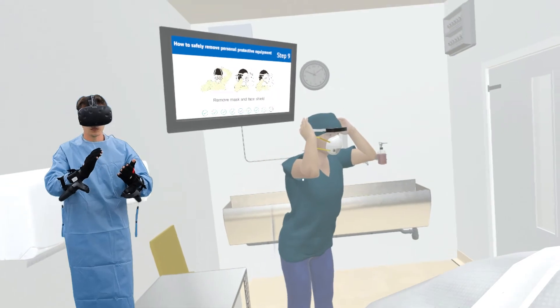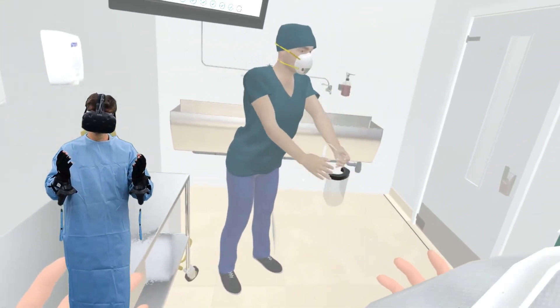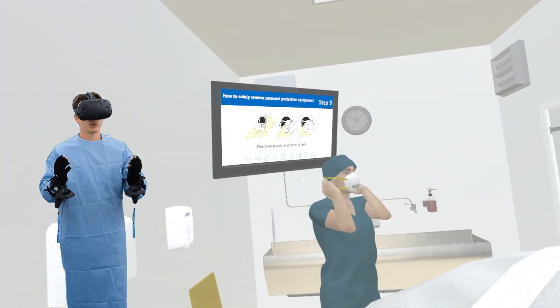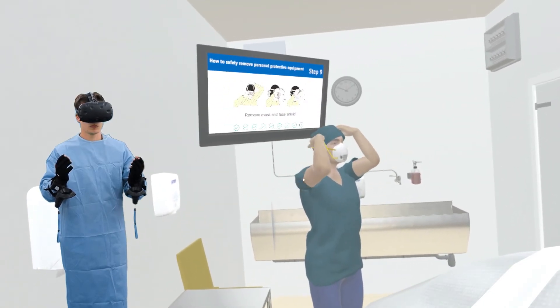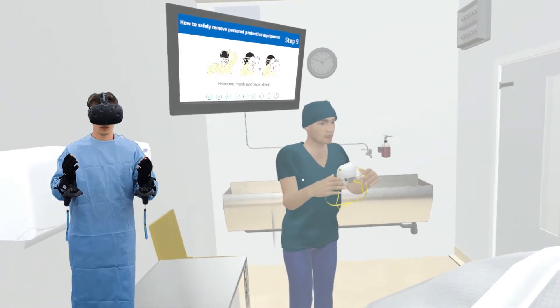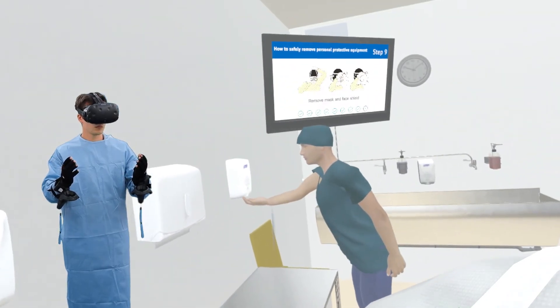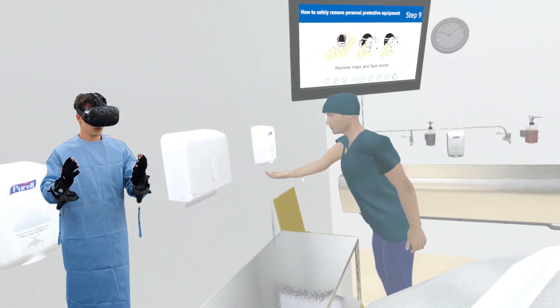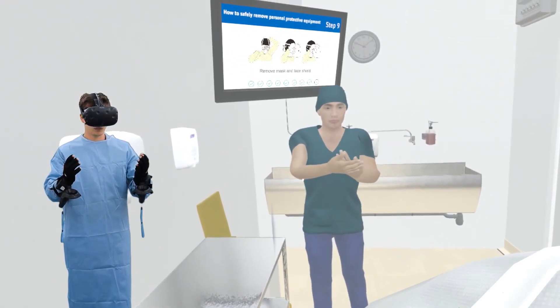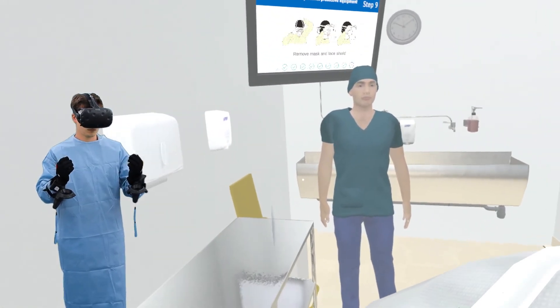Remove the face shield by grabbing the strap at the back of your head. Slowly remove it down and away from your face using the sniff position: bend forward, eyes forward, chin out. Dispose of the face shield in the garbage. Remove your N95 mask without touching the exterior parts of the mask, again using the sniff position. Remove one strap at a time, starting with the bottom strap first and removing the top strap last. Remove the straps by grasping them from the back of your head. Dispose of the N95 respirator in the garbage. Perform hand hygiene.